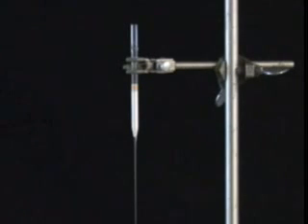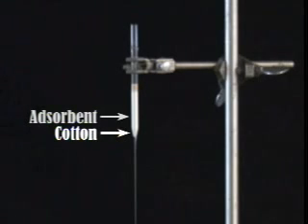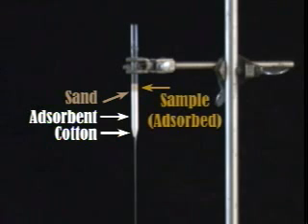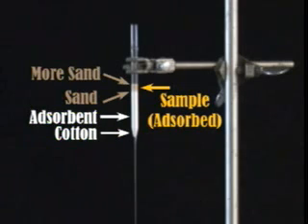Plug the end of the pipette with a small piece of cotton. Then, add a couple of inches of adsorbent and a thin layer of sand. Next, add your sample, pre-absorbed onto a small amount of adsorbent. Top it off with a thin layer of sand and you are ready to go.